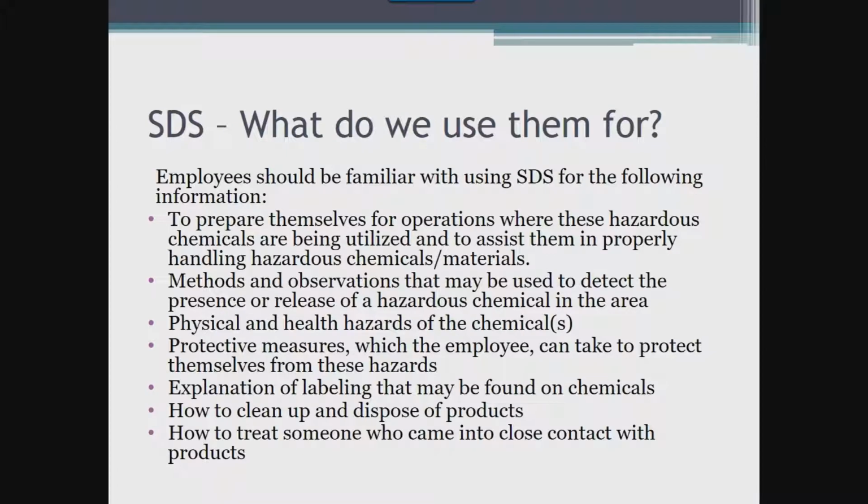So now that we've reviewed each section of a safety data sheet, how can all of this information be used? In a nutshell, the set of safety data sheets that correspond to the chemicals that are used in any laboratory serve as the base for what your chemical hygiene plan is going to look like and how your operational policies surrounding these chemicals are going to be formulated.